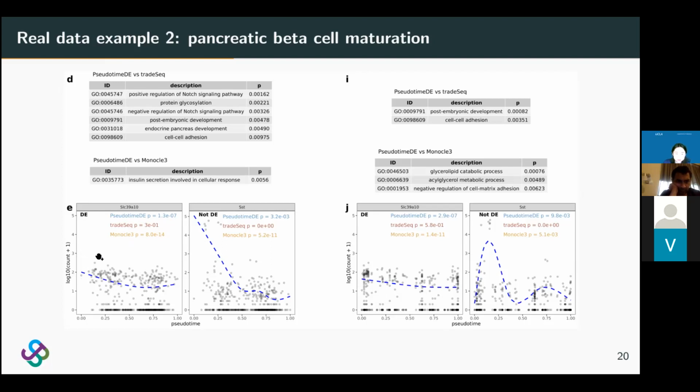Okay, so from this case, you can see that at least for this data set, the zero seems to be meaningful because zero is driving the trend. If you ignore the zeros, just look at non-zero values, the trend is not so obvious.